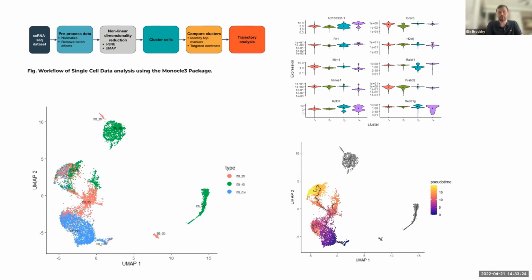And we were dealing with a project where different time points for different cell types were involved, a lot of information is there, but we were tasked with annotating the different types of cells, and then using a more or less standard procedure today, but to really study how the cells differentiate over time, or the pseudo time trajectory.